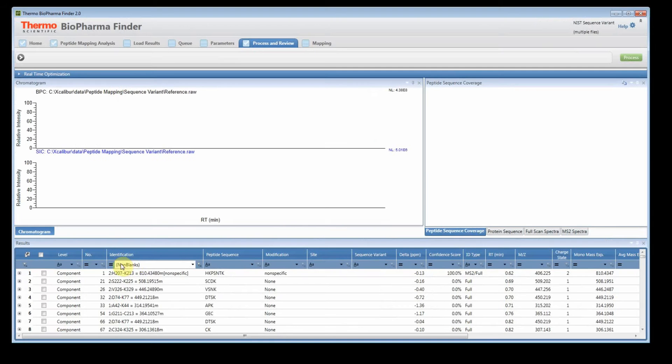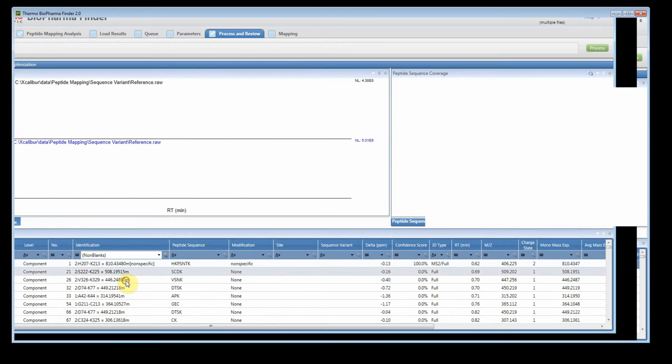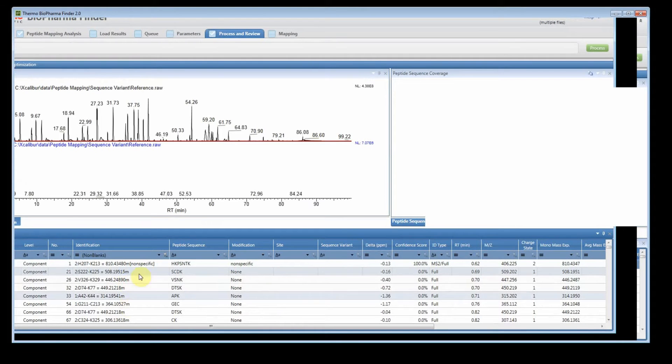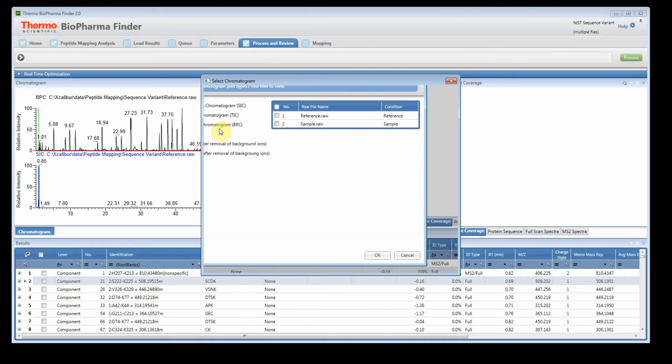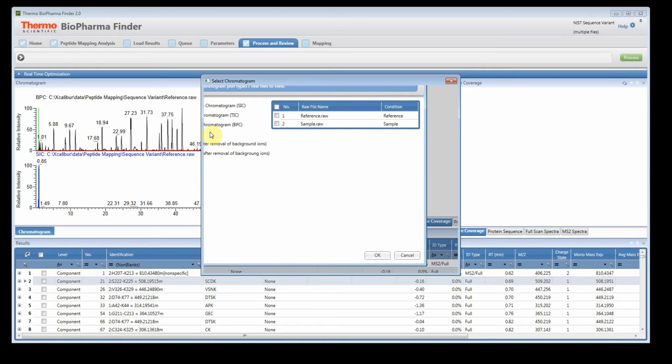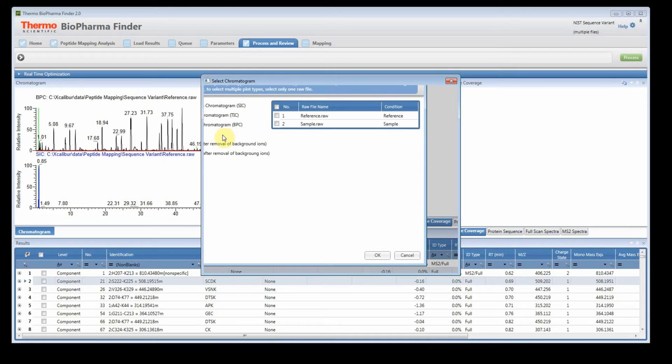And if I filter the identification, so what I usually do when I first come in, I'll filter for no blanks and I can click. And if I right click on the chromatogram, because this is two files, so we have a reference and a sample. So I'm going to show the XICs or the SICs for both files. So I need to turn off the basic chromatogram and then I'm going to check both files.